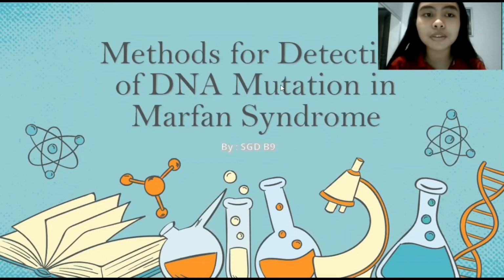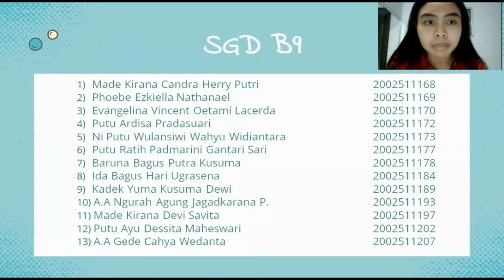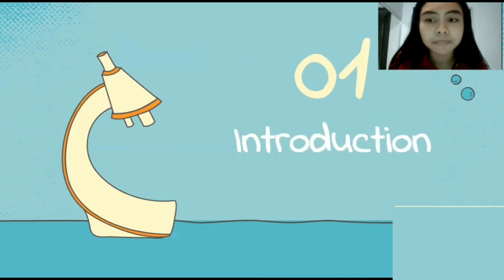We want to present our student project assessment, titled Method for Detection of DNA Mutation in Marfan Syndrome. And this is all our student member list. Let's start from the introduction.